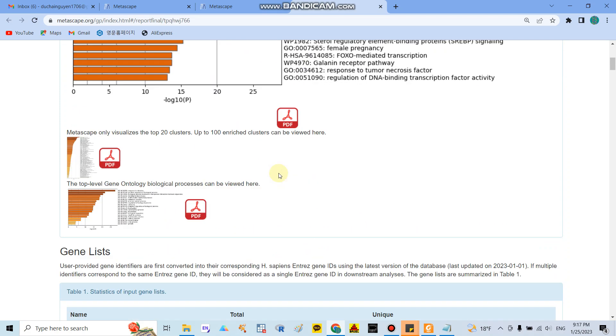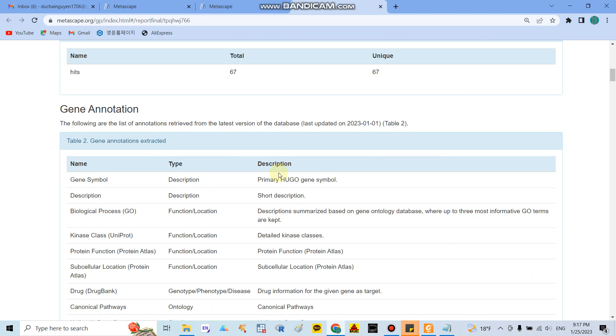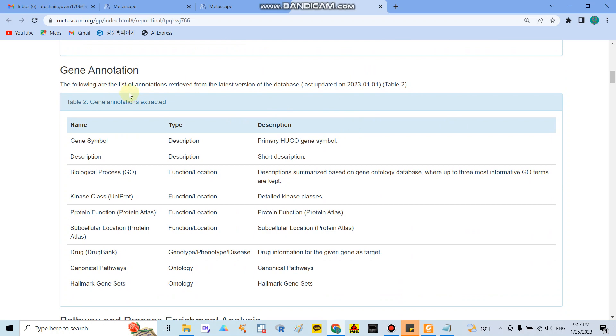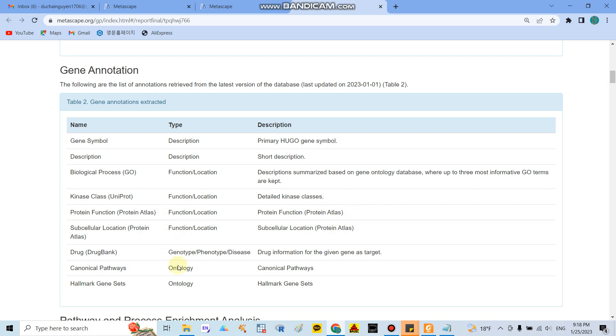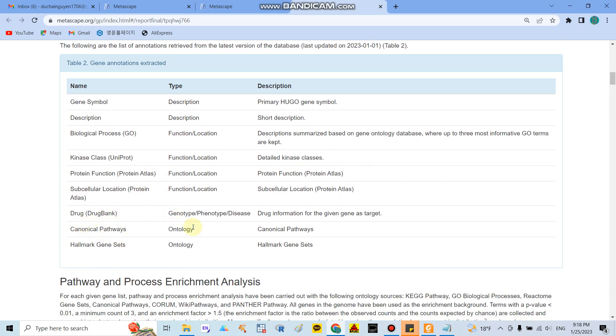So in here they will show you another table. It means that the gene annotation and here they said that in this study, in this analysis they use the gene symbol based on the HUGO gene symbol and the biological process. It means that they describe the summarized gene ontology database where up to three more informative GO terms are kept.